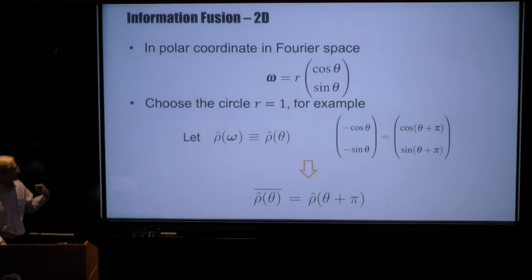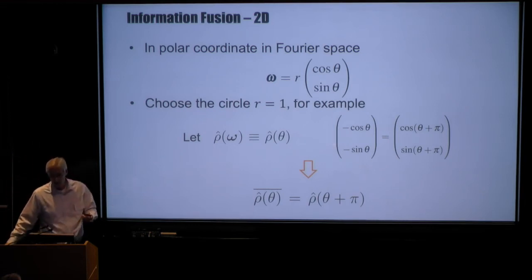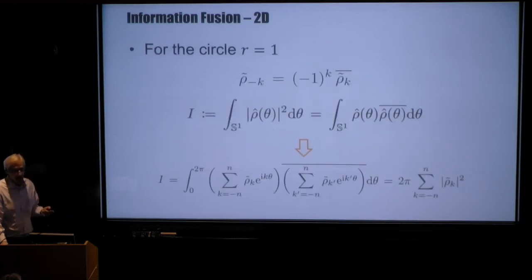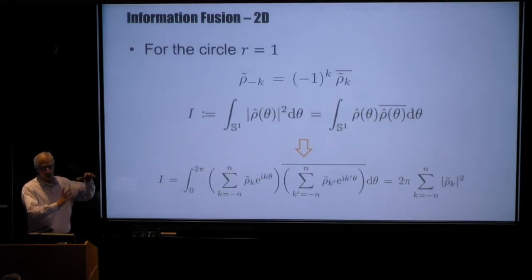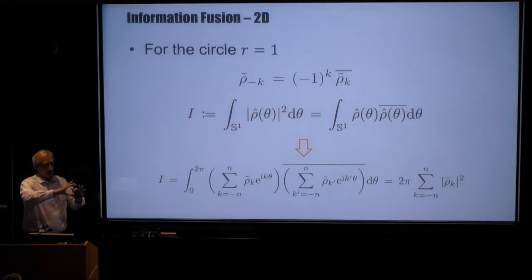If the function in real space is real valued, then that places constraints on the value of the Fourier transform. And what we're doing in Fourier space, I'm back to the 2D case. So this is data on lines going through the origin in Fourier space corresponding to our slice theorem. When we look at circles centered at the origin, we're going to develop a Fourier series in Fourier space of the Fourier transform, if that's not too confusing.